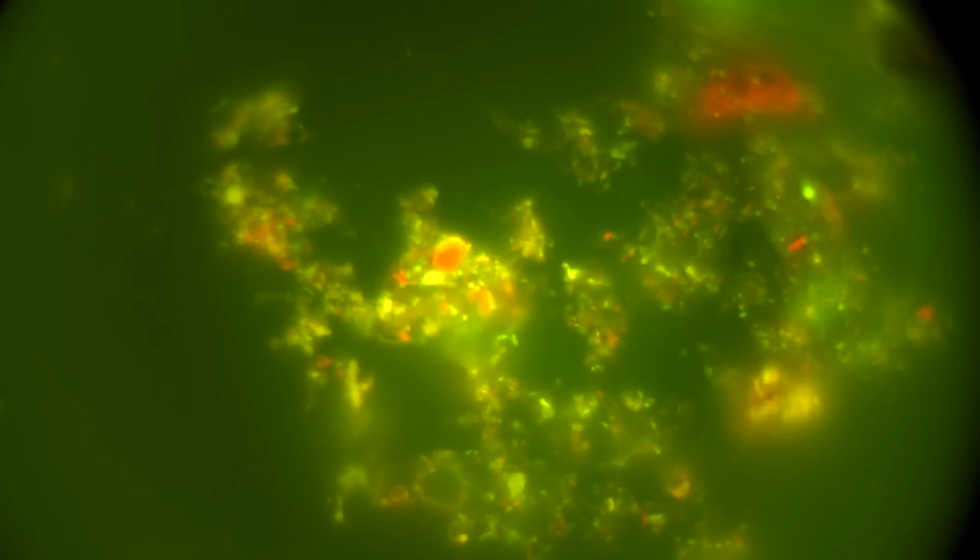It's out of range if you're not using a camera. If you're using a camera and you can adjust the brightness, like we can here, you can absolutely use Acridine Orange in a different range. So I was so excited about this.